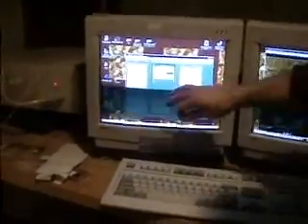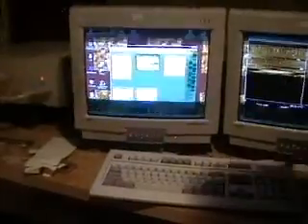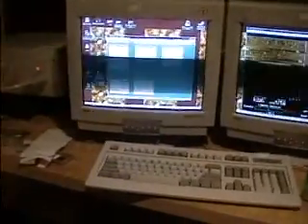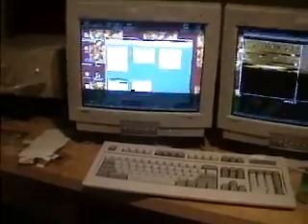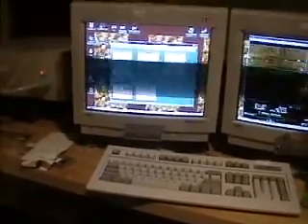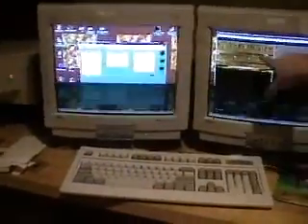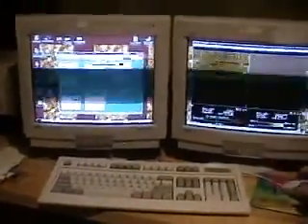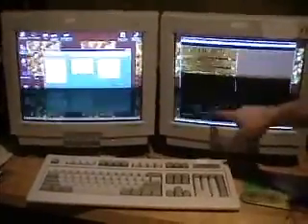Channel 1, what you type in here, as we mentioned, controls what appears in the left display. And if I look under data type, I can choose height, amplitude. Those are the main two that we ever use. Data scale just determines what the Z scale is here. So right now it's set to 20 nanometers. So going from full black to full white corresponds to 20 nanometers, and that's indicated down here where it says Z range of 20 nanometers.